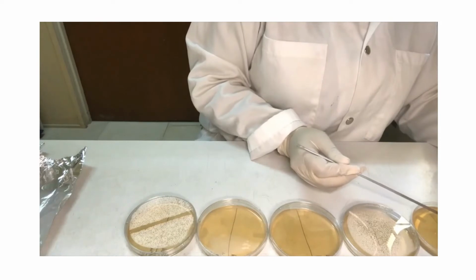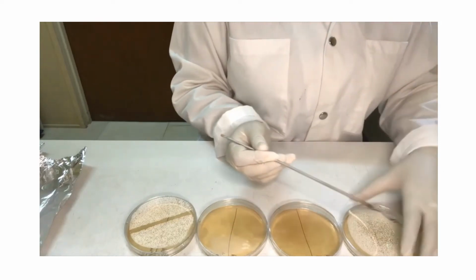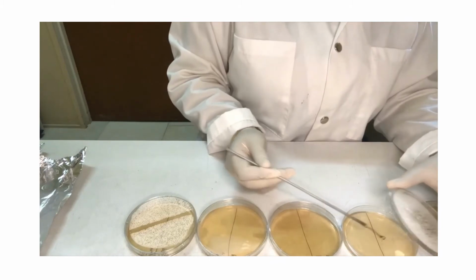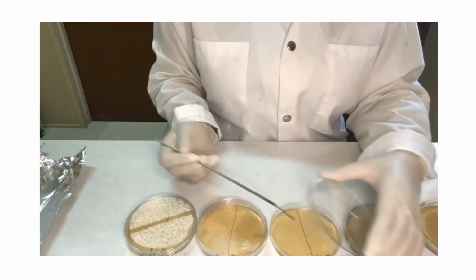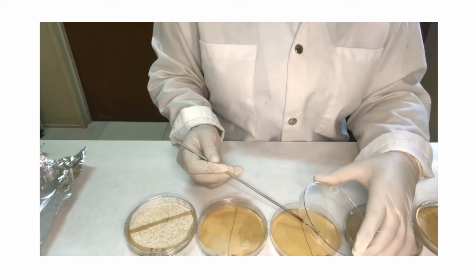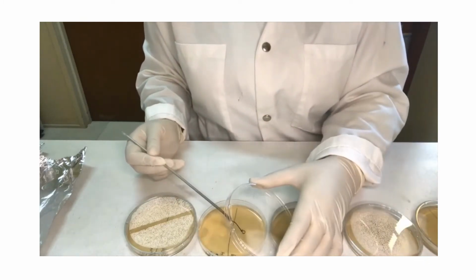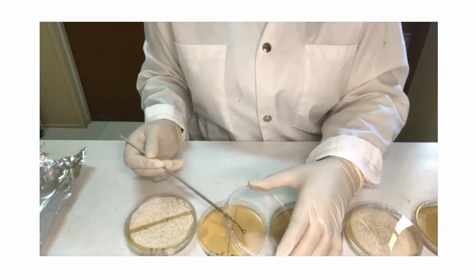Region 2 on all 5 plates is then inoculated with strain 2 bacterial cells. At the end of the process, Region 1 and Region 2 would have been inoculated with strain 1 and strain 2 bacterial cells respectively.